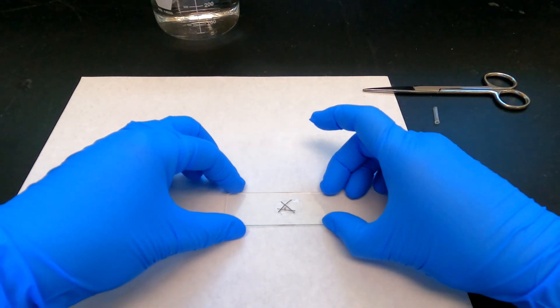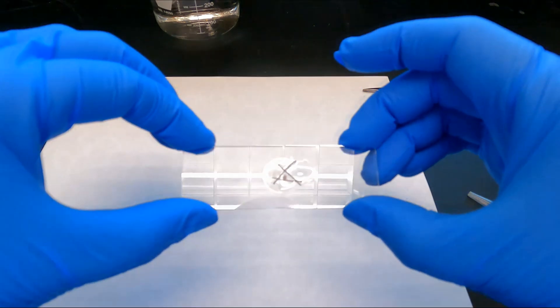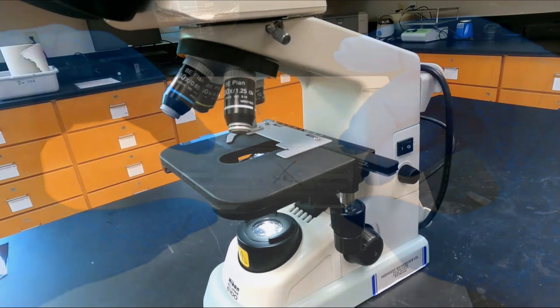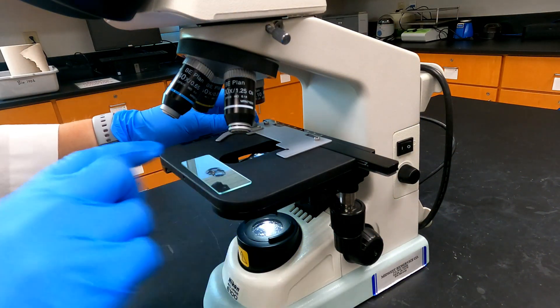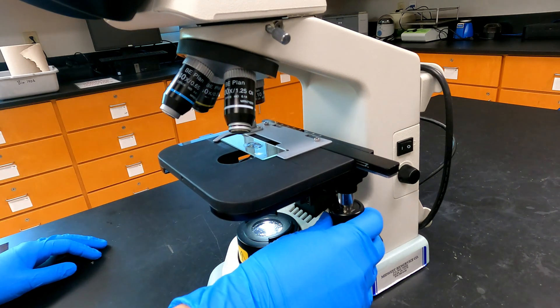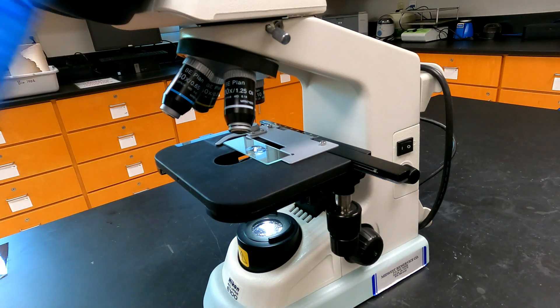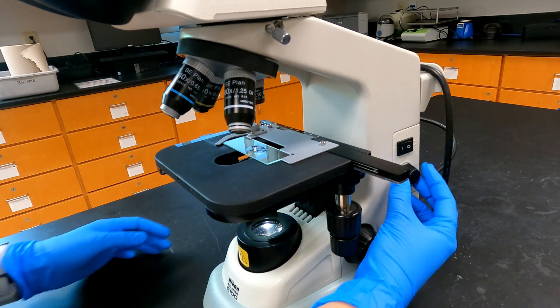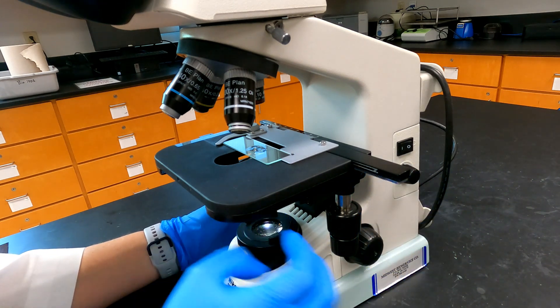Once you have your Daphnia prepared on the slide, check your microscope to make sure the stage is in its lowest position and the 4x objective is in place. Then go ahead and place the slide on the stage, securing it with the slide holder. Center your Daphnia in the path of light coming through the stage. Adjust the amount of light so that you can comfortably look through the ocular lenses, and then raise your stage to its highest position using the coarse focus knob.